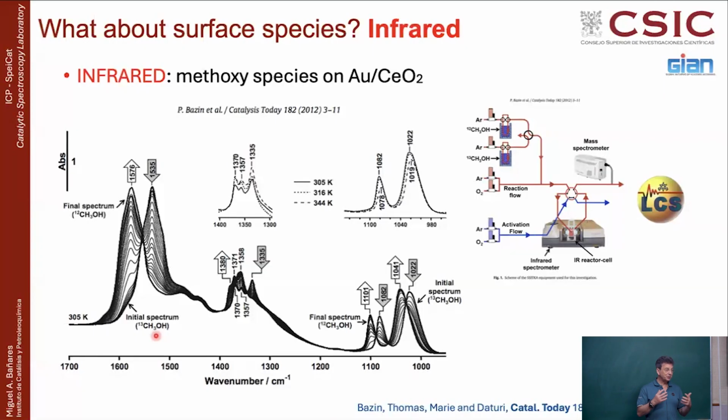So during a reaction, you have a carbon buildup of things at the surface. If you are only using Raman, you will essentially say, oh, I see a lot of polyolefinics, coke, polyaromatics, and whatever. And this is what Raman is reporting to you. If you look at the same sample with infrared, oh, I see a lot of formates, oxygen-containing things, because this is what infrared is reporting to you. None of them is absolutely right. We are describing the elephant from different perspectives.